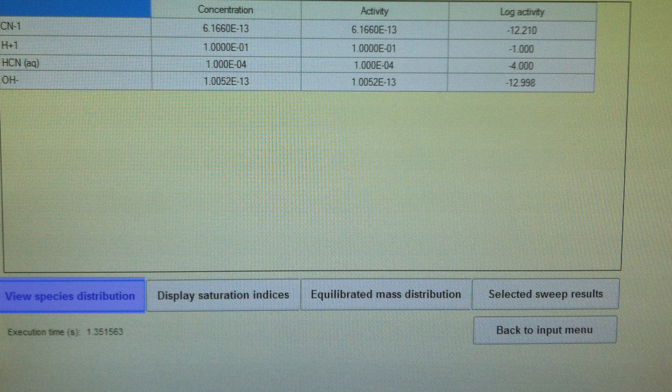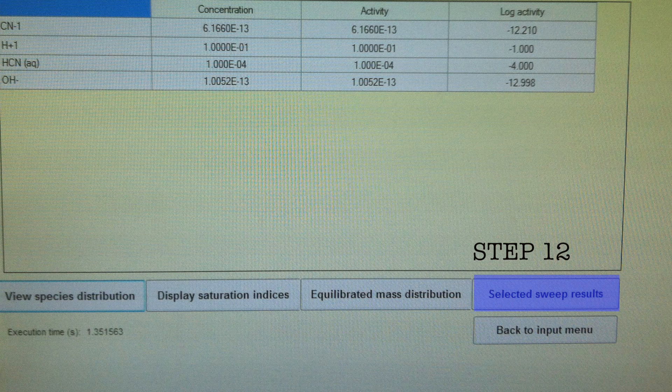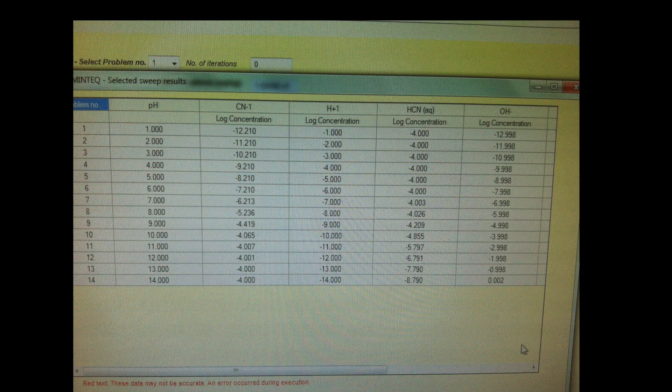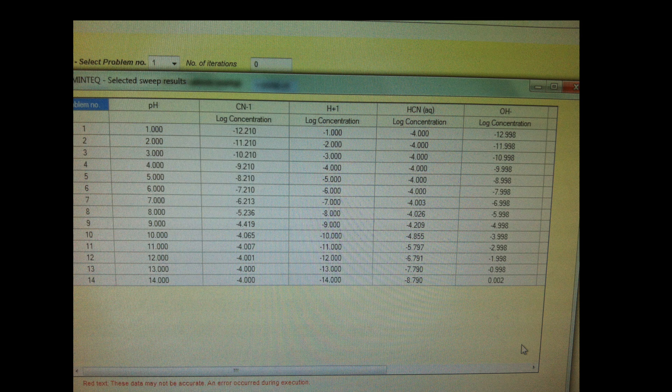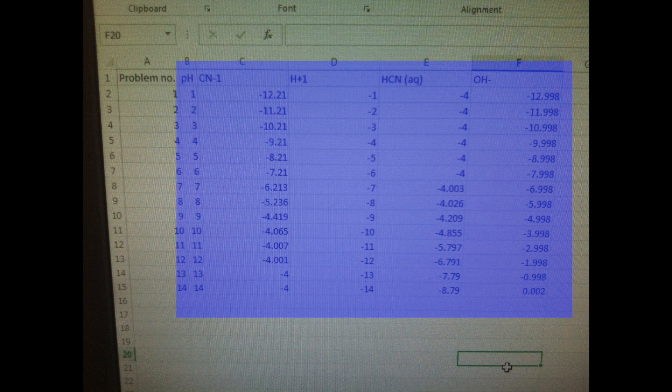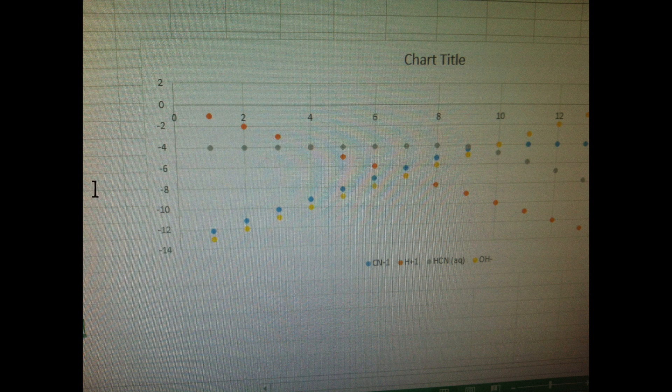We could go to the bottom and let's view our sweep results. This gives me information for every pH value that I wanted and this looks familiar. We can export this to Excel and then we can actually do a scatter plot and see what our speciation diagram looks like.